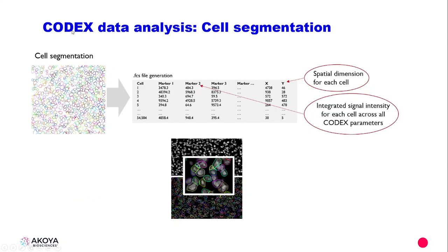With Codex Data Analysis and MAV, all of the data come into MAV post-segmentation. The segmentation actually occurs in the Codex processor and is read into MAV. The segmentation file includes X and Y spatial coordinates so we know where each cell is inside the tissue, and it also has columns for each marker or antibody, so we have all the cytometric information about each cell and their spatial location.